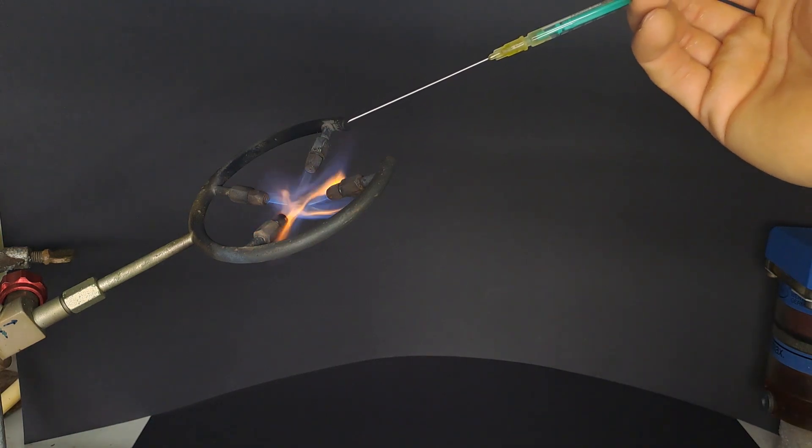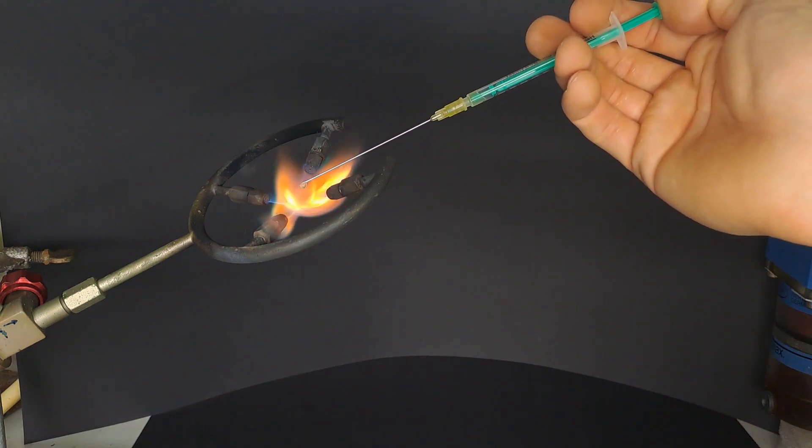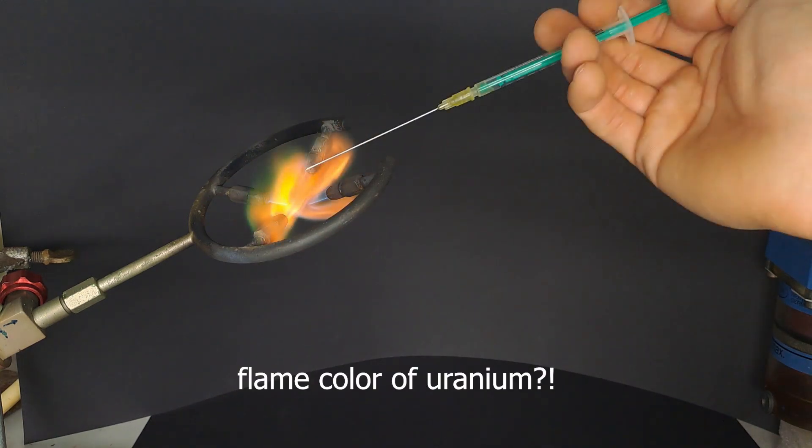How about balancing the drop on the needle? Aha! I see green! But is it really from the uranium or is it just from the needle?